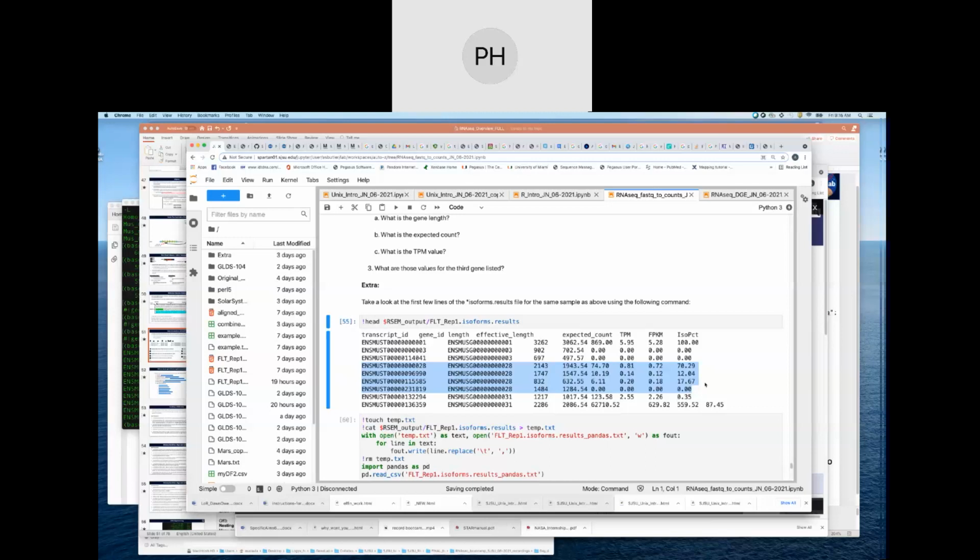As you can see there at the bottom, that number 1863, I got 0.66, I think that's just a rounding thing, matches the length for that gene. So that's how that length is calculated.